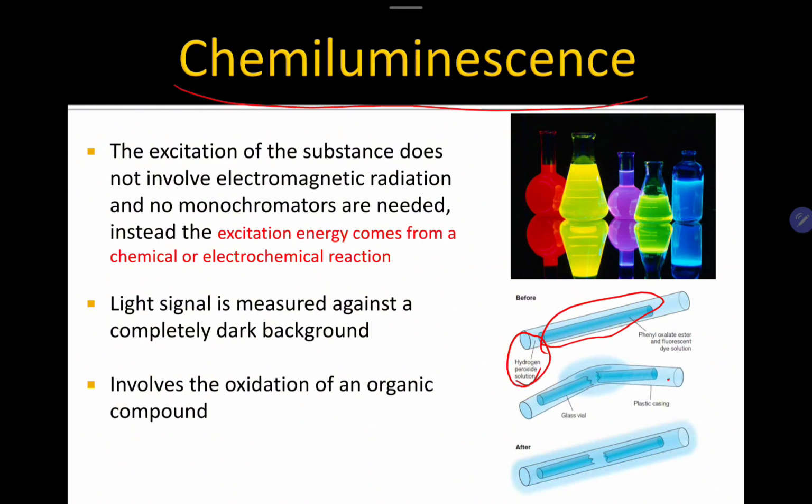So dito guys, walang involvement ang light source, no. Hindi ka gagamit ng mercury lamp, xenon arc, or mga flame para mag-emit ng ilaw, but rather because of chemical reactions kaya siya umiilaw. Yun lang talaga siya guys.